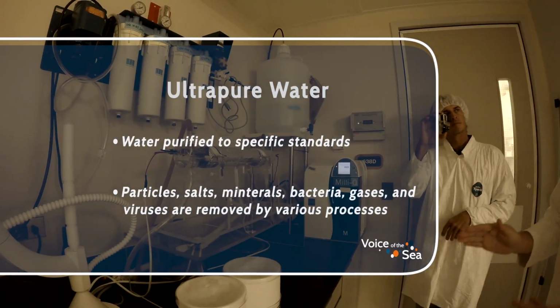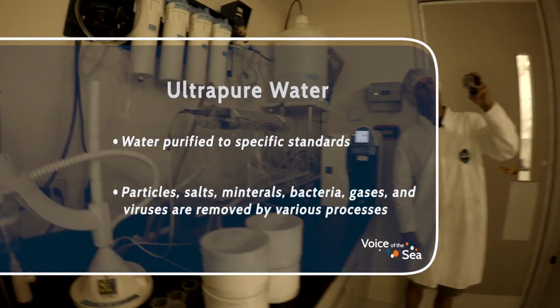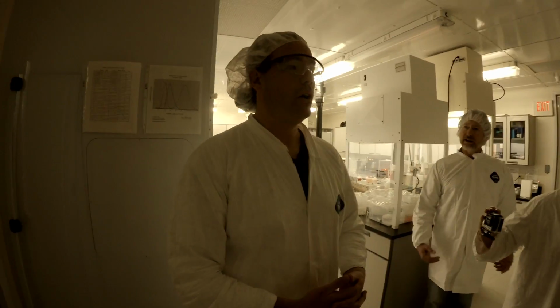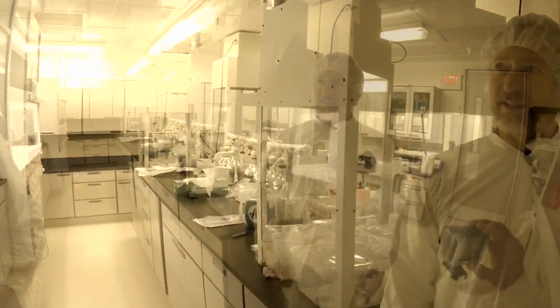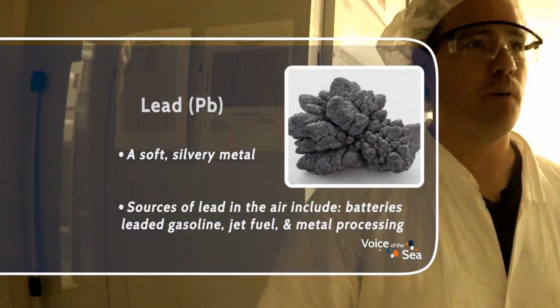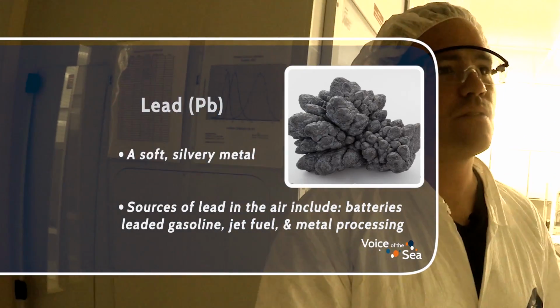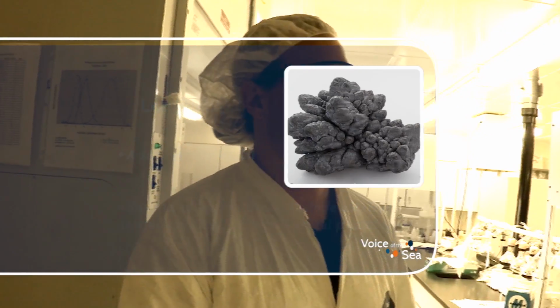The amount of lead, for example, in that water is less than a part per trillion. Wow. So now, why is lead more susceptible to contamination than mercury? Two reasons. It's a volatile element, so if it heats up, it will volatilize and evaporate. But the main reason is because of tetraethyl lead additives to gasoline that were used for decades in North America.